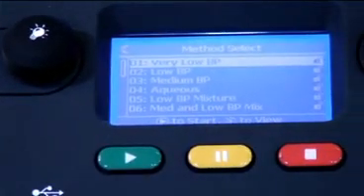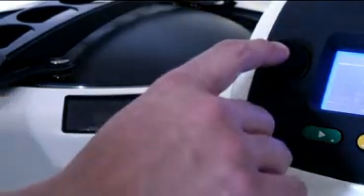The system is operated via simple controls. A built-in strobe lamp enables each sample to be viewed separately and in real time during the evaporation process. Your local Genovac representative can help you optimize and load new or updated methods to your system.